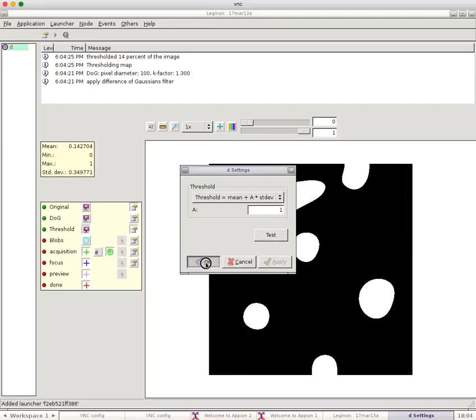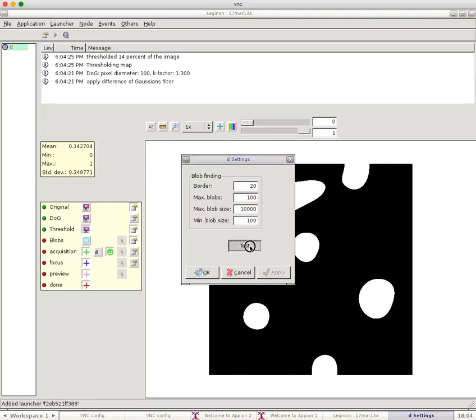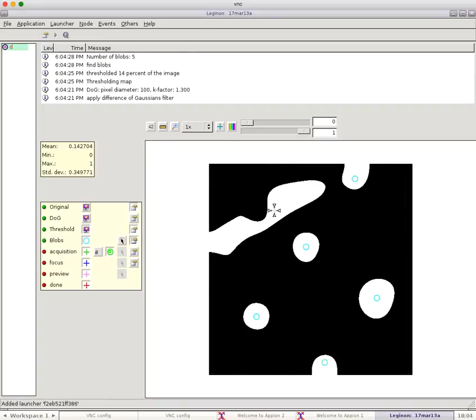Then I'm going to threshold the image. I'm going to do blob finder. So it eliminated this hole, but it found the other five holes. This one had too large of an area.